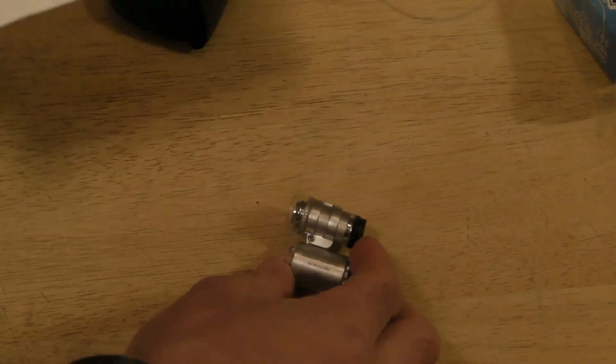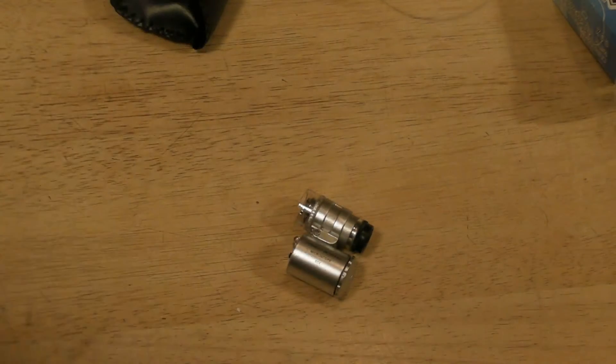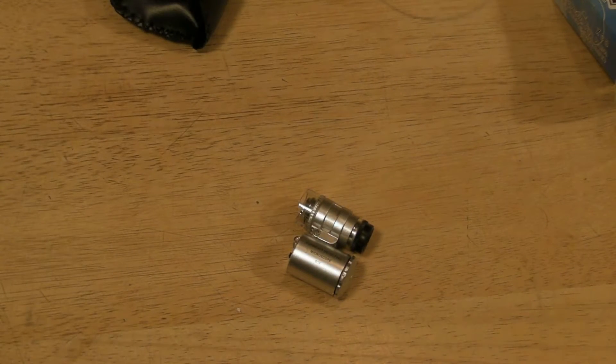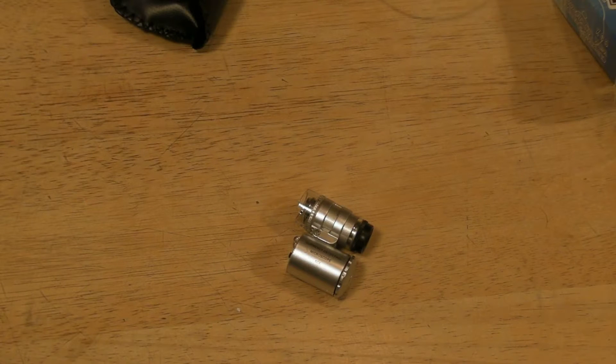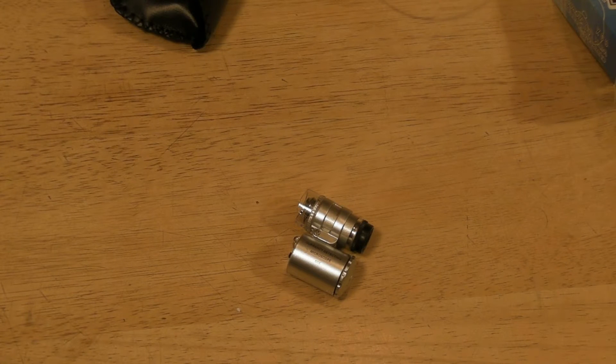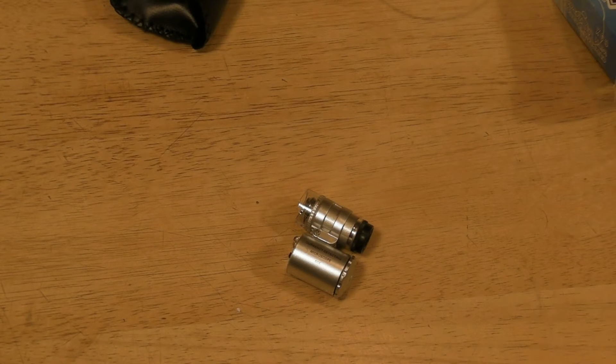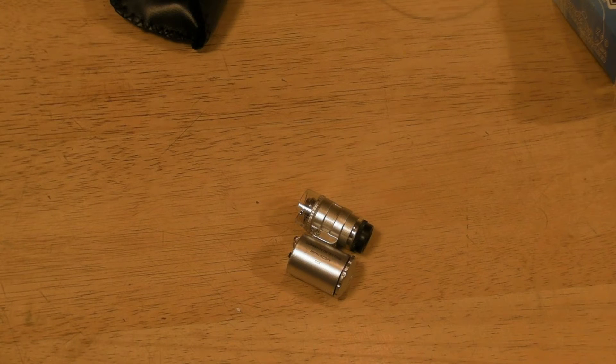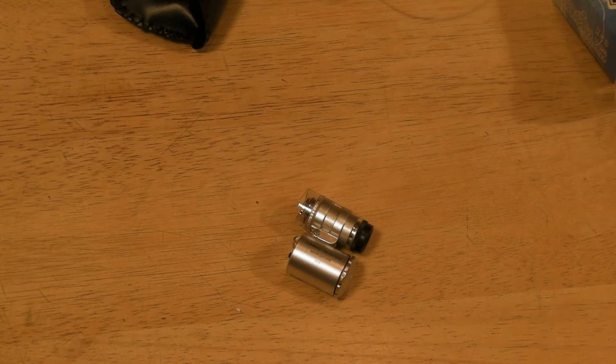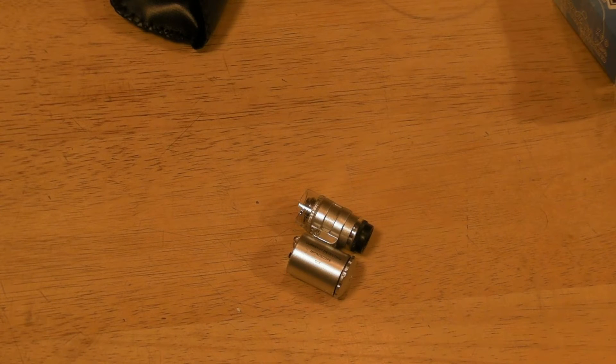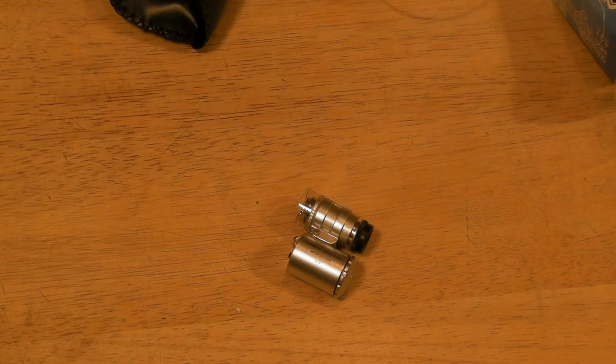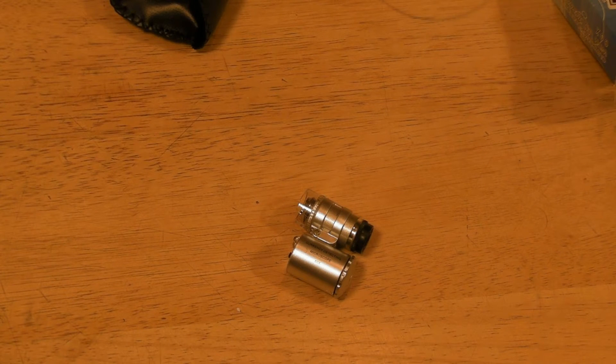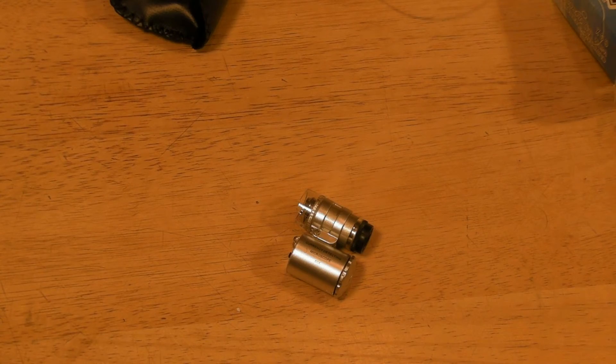Alright so I'm going to set that down and read the directions. How to operate: Put sample on a flat surface. Place microscope vertically with hand and objective lens facing downwards. In time of insufficient light turn on the switch to start the LED lamp. View sample by eye lens if image is not clear. There's a focus knob.